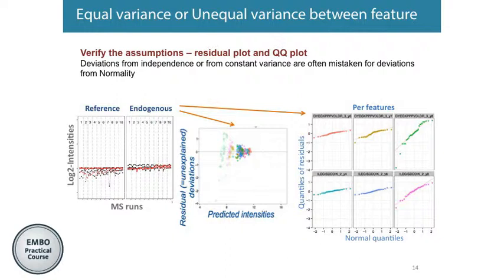So if you use MSstats to generate the two plots, let's see what happens in the residual plot. This black line generates a much broader range of residuals, but the other one is quite a bit smaller, whereas we expect them to have a really similar pattern across the rows, with a similar range. But here they have a really different range. We can also confirm this from here.